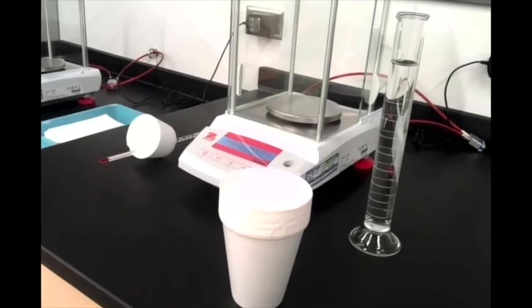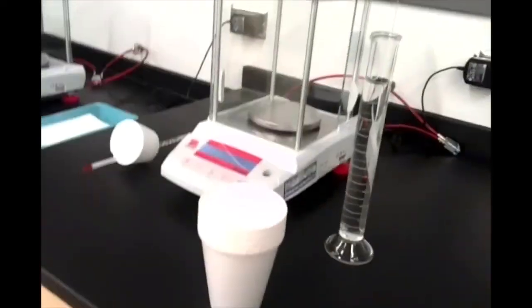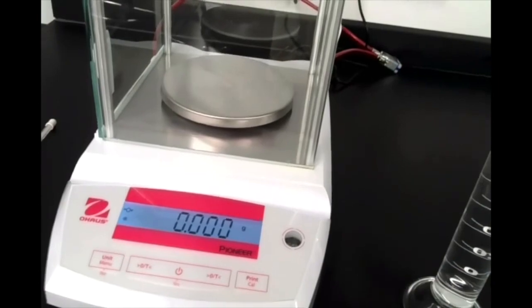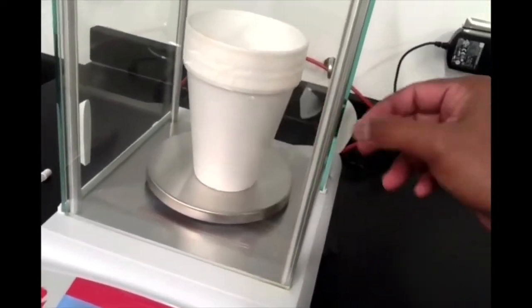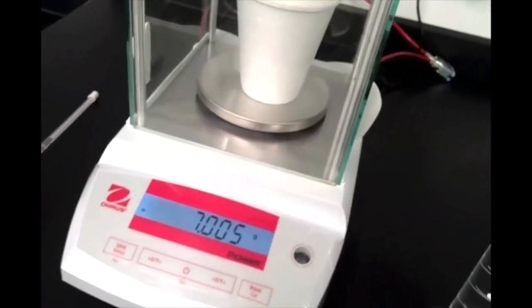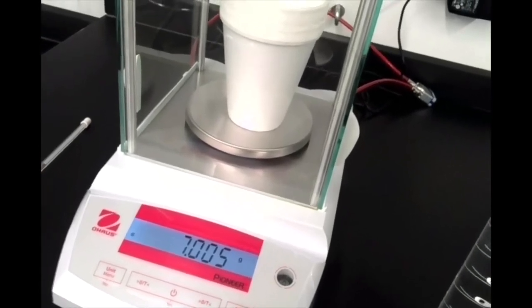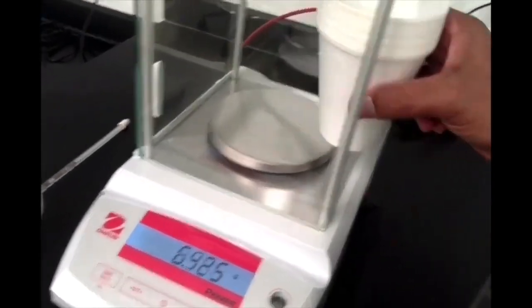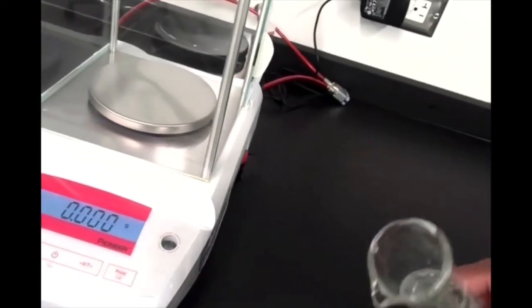Anyway, we have here a styrofoam cup, and so to begin this part of the lab, we're going to determine what its mass is. So note that I've tared the balance, and add our empty styrofoam cup in there. There we have the mass of our styrofoam cup. Now to that we're going to add our 100 milliliters of water.